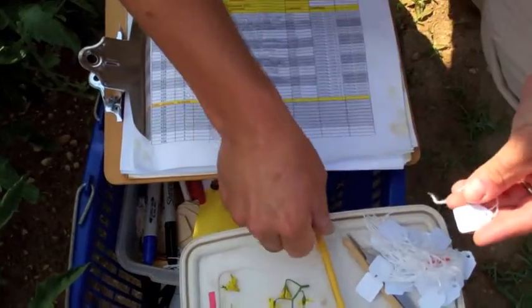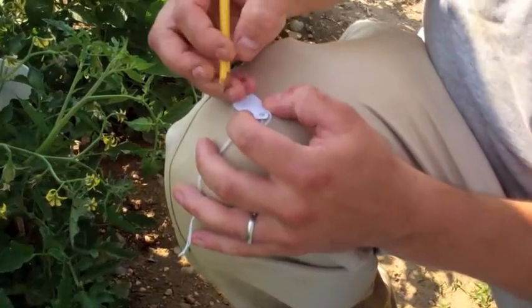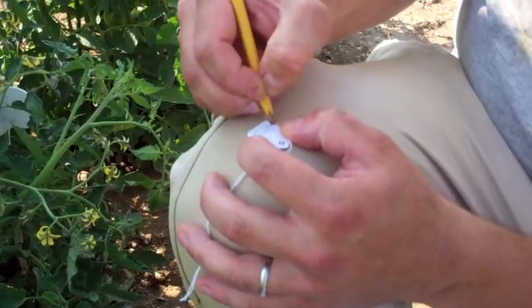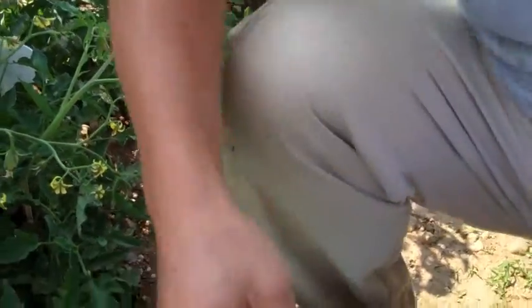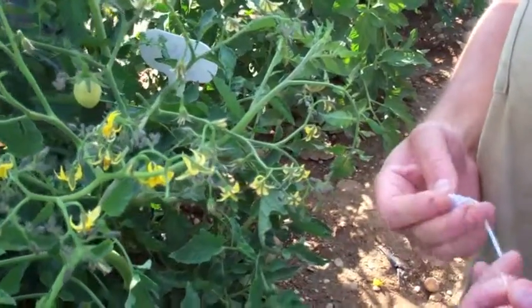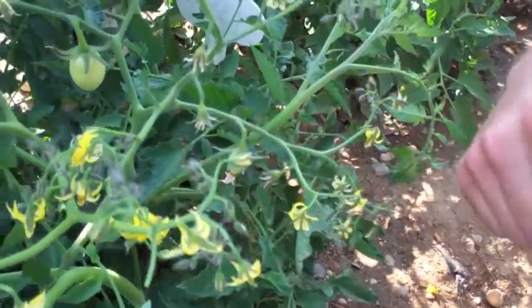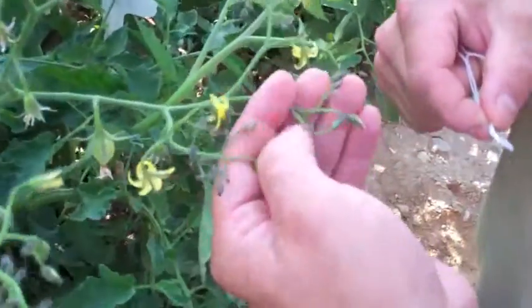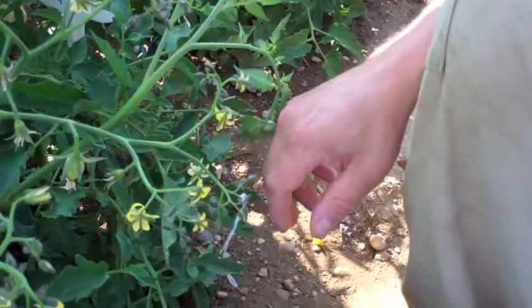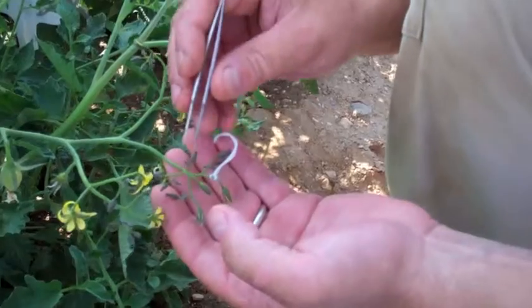First, take a crossing tag and prepare your label. Put the label on the female, then prepare your emasculation.